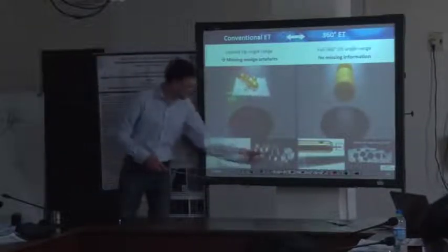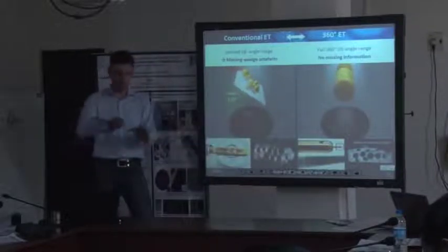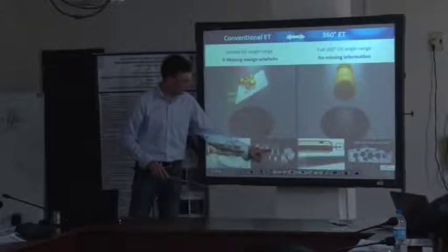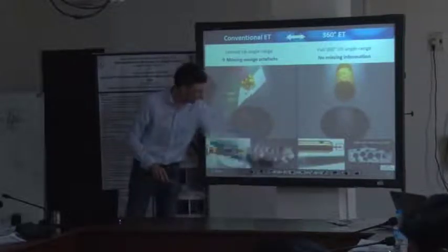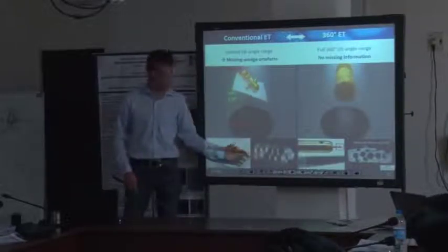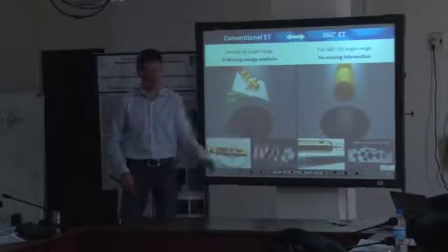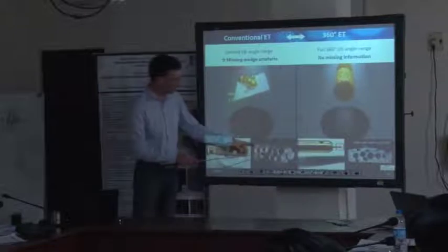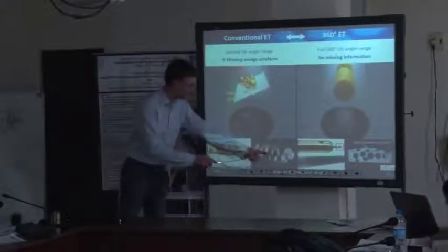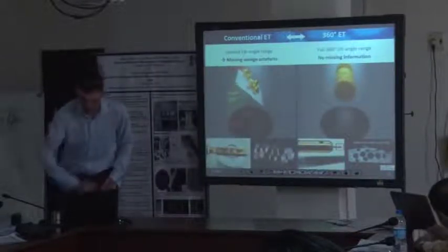And this direction is shown here. So this is the particle in principle lying on a TEM support film. If you tilt that from the top, you get very clear and sharp boundaries of our pore structure here, for instance. But from the side, we don't get any information. So we don't really know where the particle ends, because you don't see it in that direction. Okay? This is why during the reconstruction, those so-called missing wedge artifacts form. So we end up with an elongated structure in this direction, because of this missing wedge.